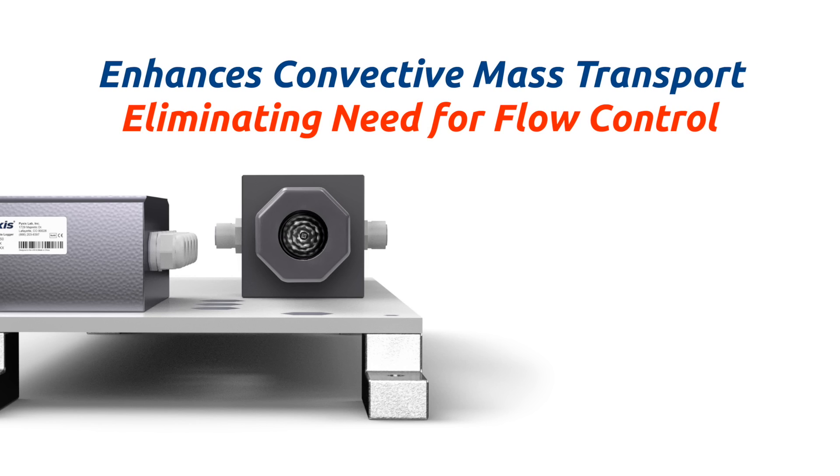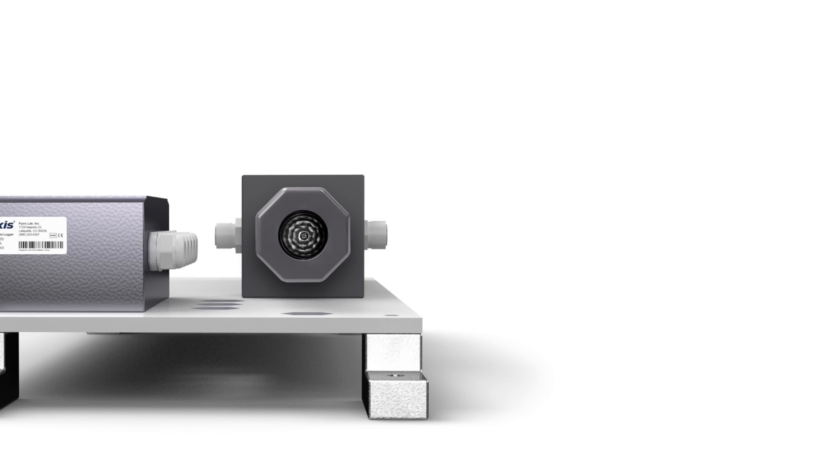This unique device enhances the convective mass transport of the oxidizer analyte to the sensor's surface, eliminating the need for precision flow control commonly required for other amperometric sensors on the market.